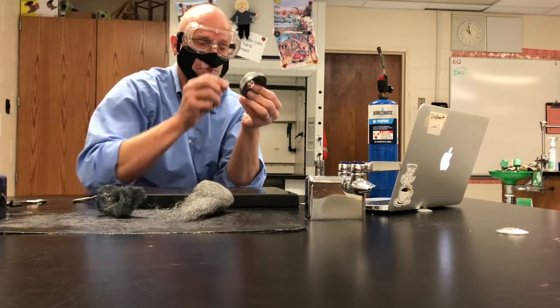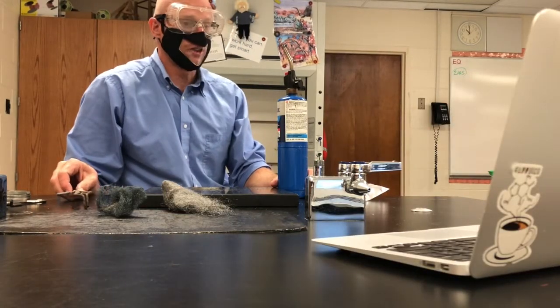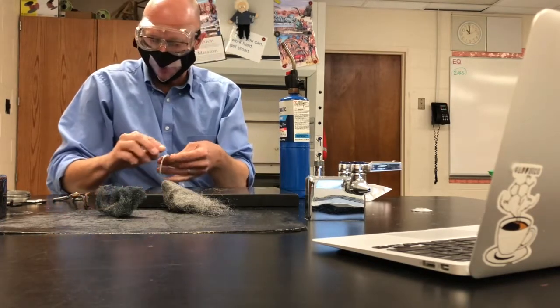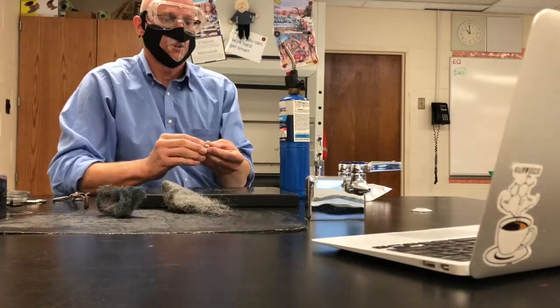Magnesium. I'm going to ask Marissa just to turn the lights off for this one, okay? Can you do that, Marissa? Okay.